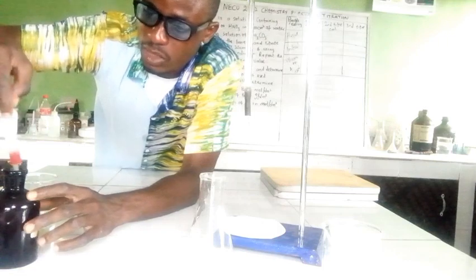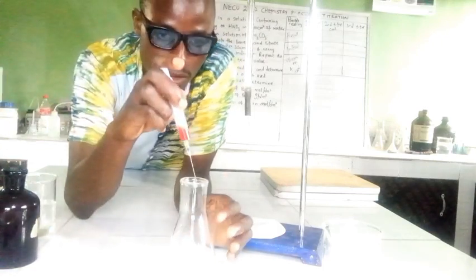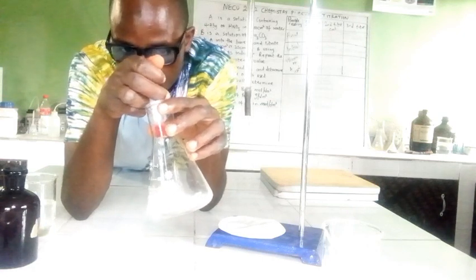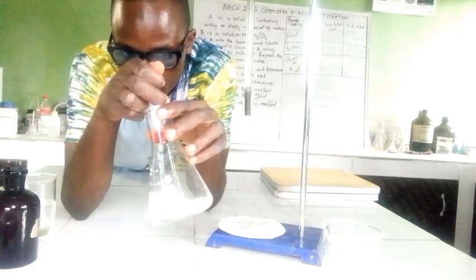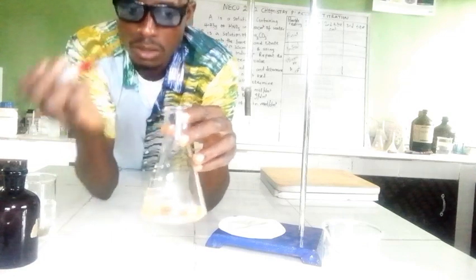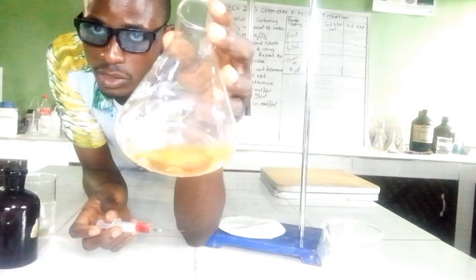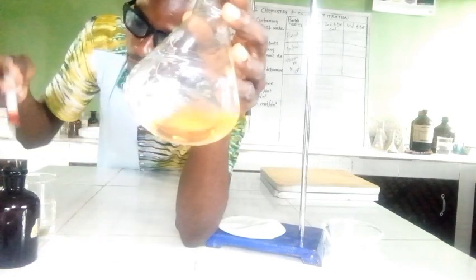So now let us add our indicator. And we expect the color yellow at this point. Okay, this is yellow in color, as you can see. So the color is yellow now. Then we titrate and we'll be expecting a change in color to what?